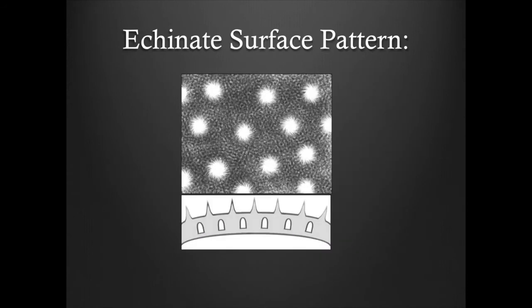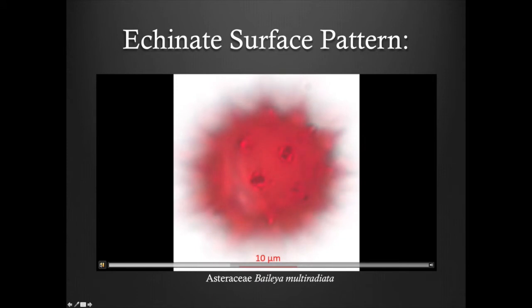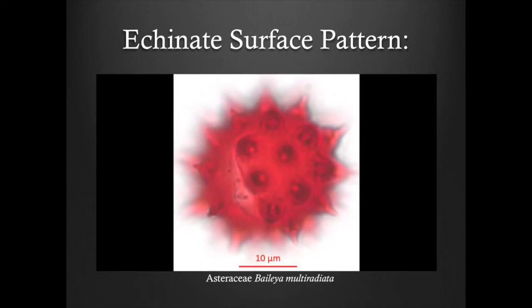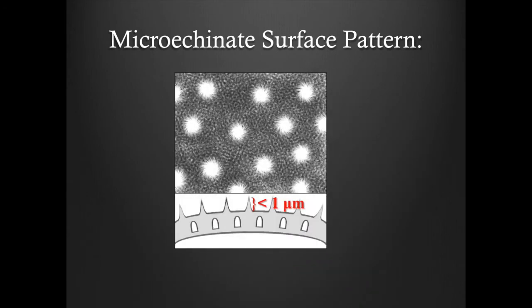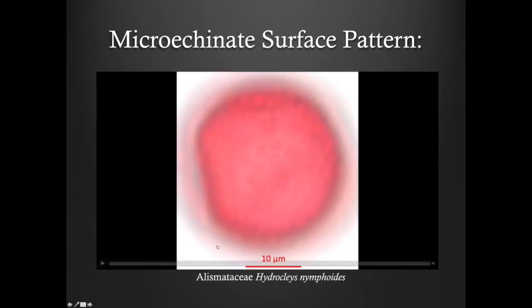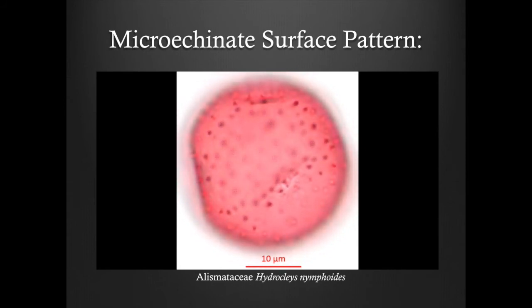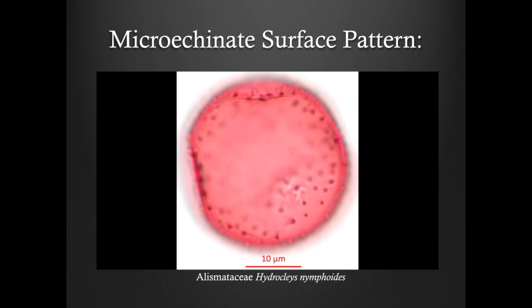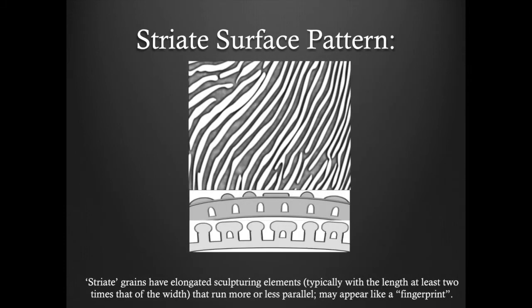Here is an example of an echinate grain. And here's an example of a microechinate grain. Striate grains have elongated sculpturing elements that run more or less parallel to each other. The surface may even have the appearance of a fingerprint.